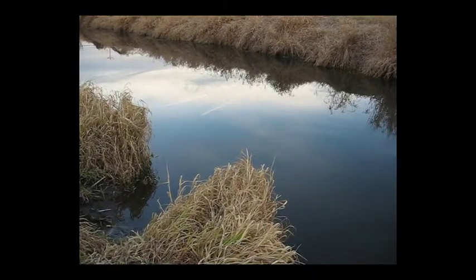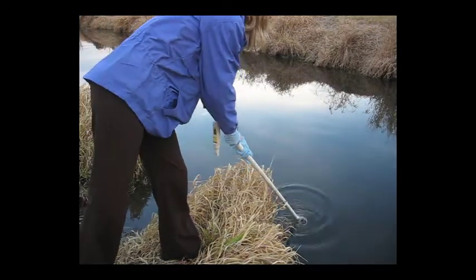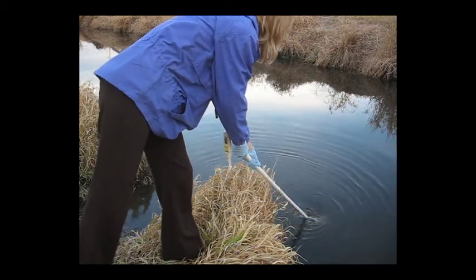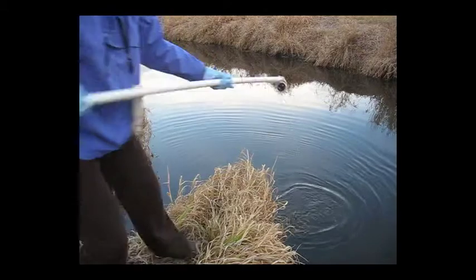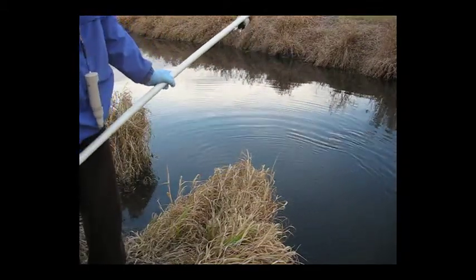Partially fill and rinse the sample bottle with the stream water that will be sampled. Avoid getting sand or sediment in the rinse water. Shake the rinse water in the bottle and then pour it out. Repeat this rinsing process 3 times.